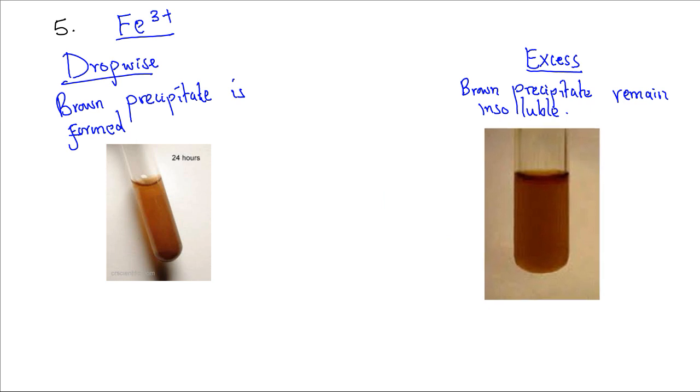So this is when it is few drops, and that is excess. These few drops, even if you leave it for long, it will still remain insoluble.